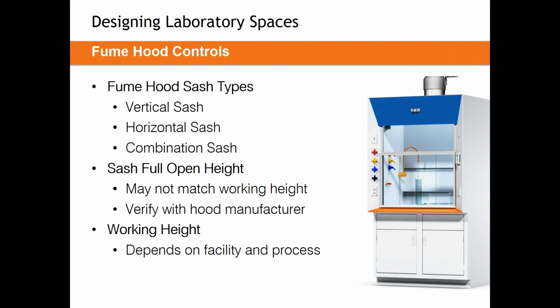This is where we're going to start to recommend that interviewing the people using these fume hoods is the best way to find out how to design a lab. Interviewing the person that's going to be dedicated to that fume hood, they'll tell you what chemicals they're using, what sash height they need to be open to. They'll even tell you what type of fume hood they prefer. They are often experts in this field and can really help navigate those decisions. If you can't get that information, there are some assumptions we can make, but it's always best to get it from the working staff in that facility.